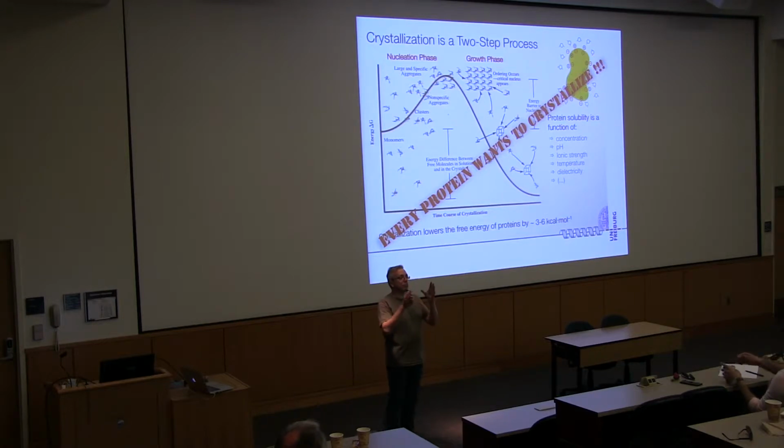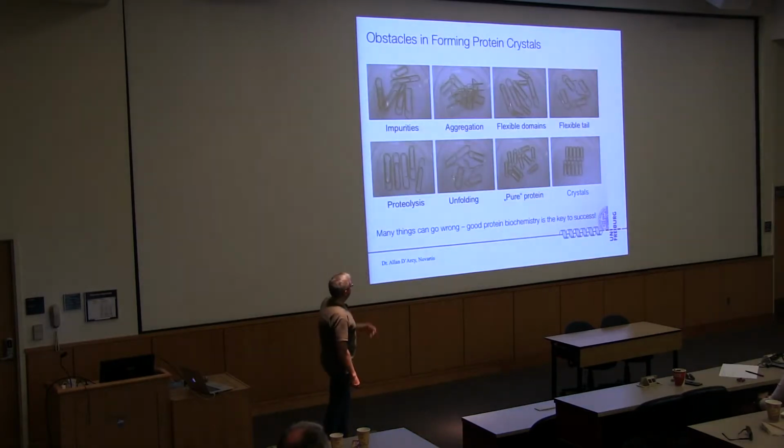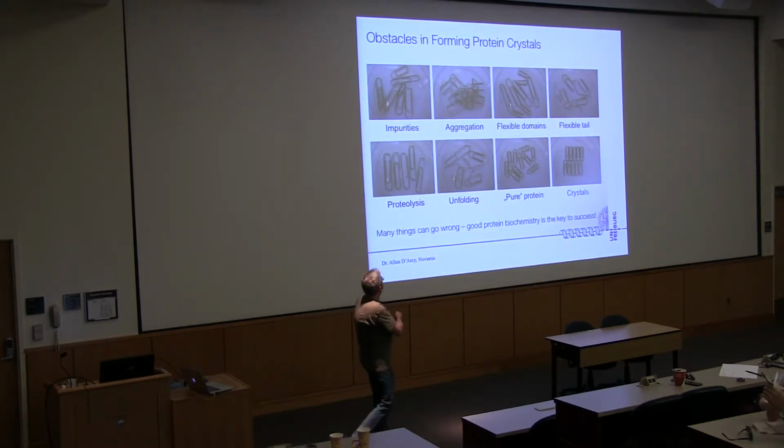We tell those molecules to stand in line before we actually shoot them with X-rays, rather than electron microscopy, where you just shoot and then you see who's lying around there. Texas style. Sorry, apologize to all the Texans.